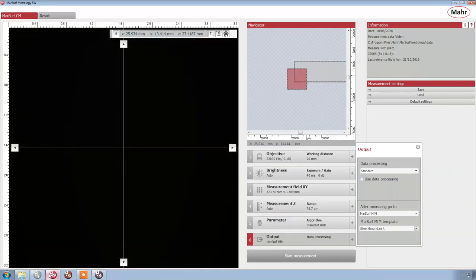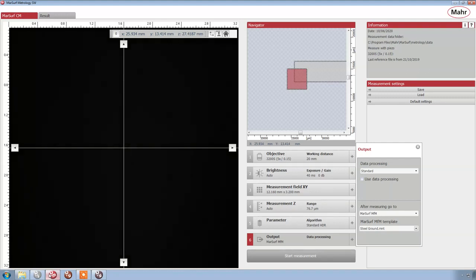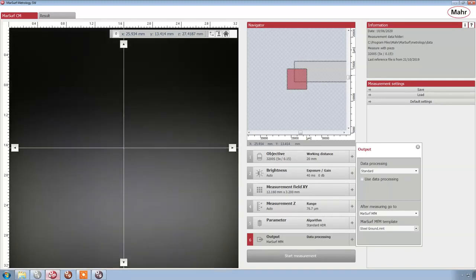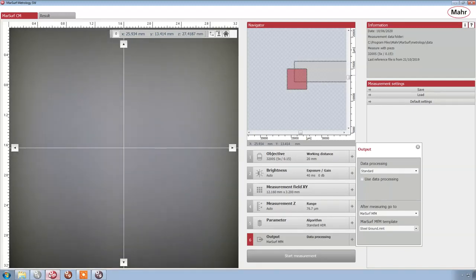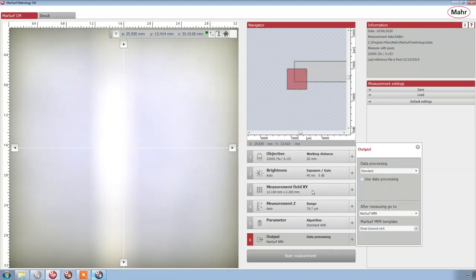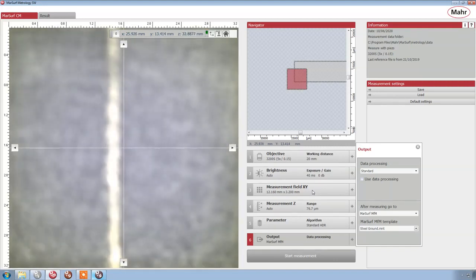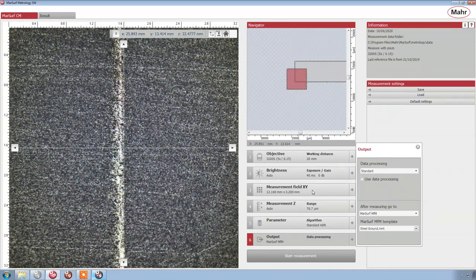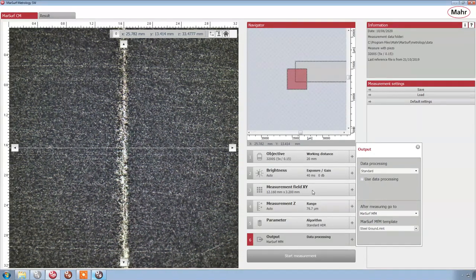So I'm taking the steel coupon and the V block off, and I'm putting the next part on there. I'm going to jump to the ceramic coupon as my next part. So I've got my 5x lens, my brightness is on auto. I'm going to move the head up a little bit to get my focal position, and this is actually the ceramic. It's the alumina coupon.